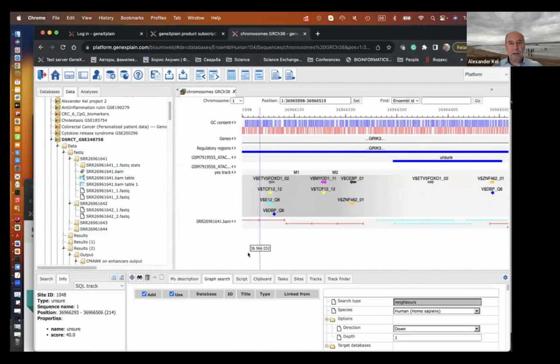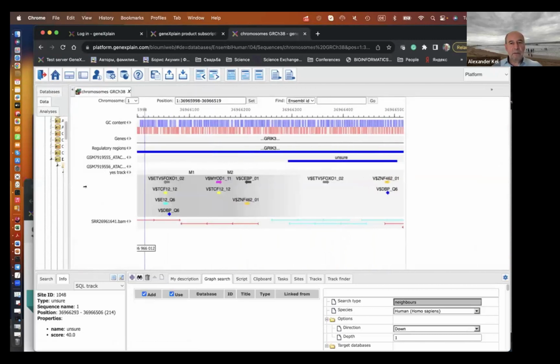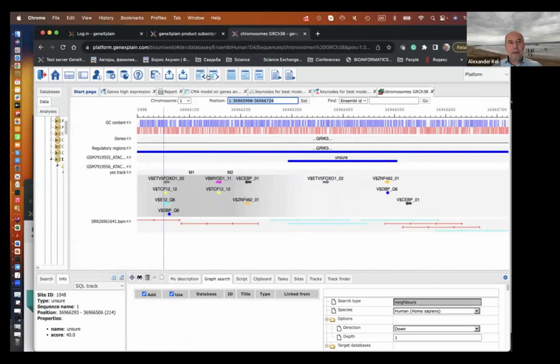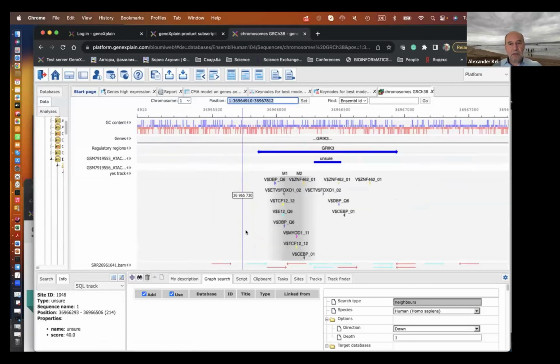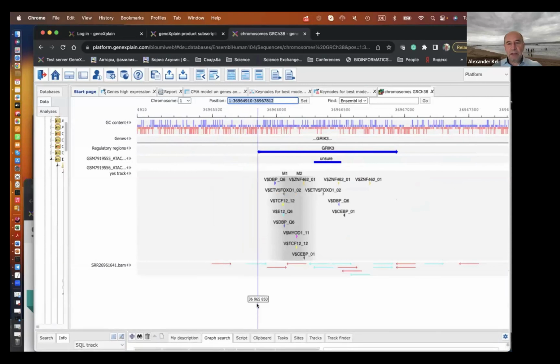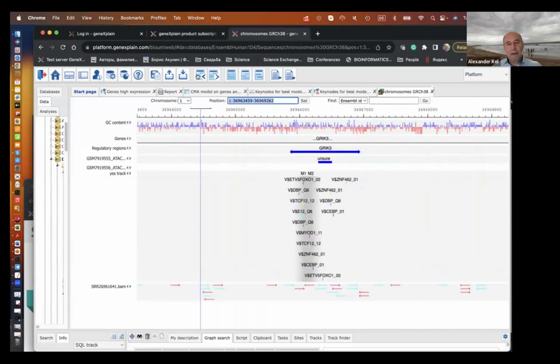if you put here the BAM file, yes. Well, it's maybe not the best BAM file. We have other, not here. All right, so I have them in a different place. So these are the reads which were found in that region by ATAC-seq experiment. It's not a very high peak though, but still the peak calling algorithm considered this as a kind of wide peak. And the center of that peak is somewhere here.